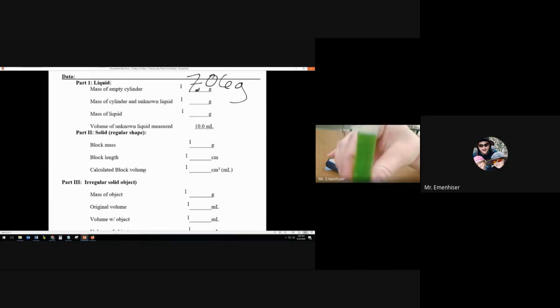And now I'm trying to show you that it's at that line, but we can't tell. Sorry, dude.